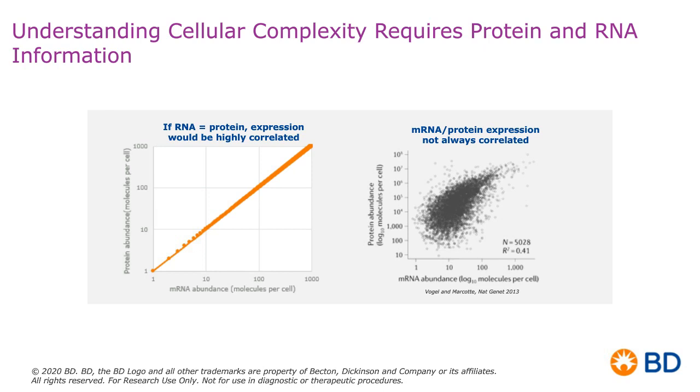Biology likes to throw all sorts of curveballs, and the reality of how mRNA correlates with protein is here on the right from this publication from Nature Genetics in 2013. And looking at these different log scales, you could see that unfortunately mRNA does not equal protein. In fact, it's far from it.